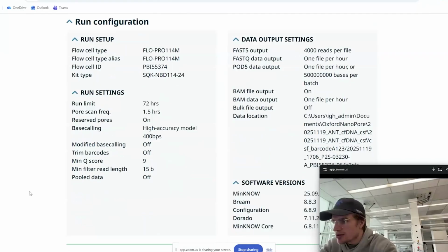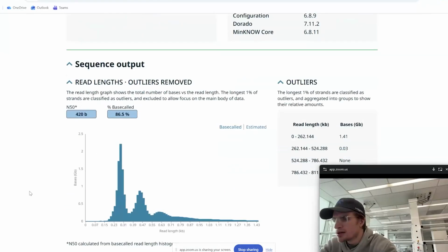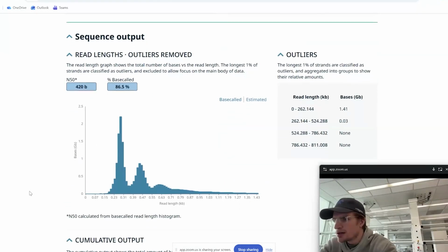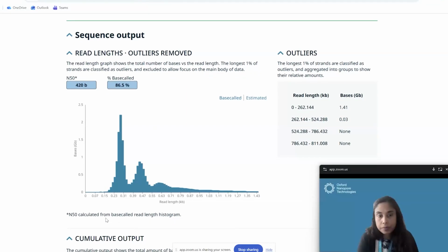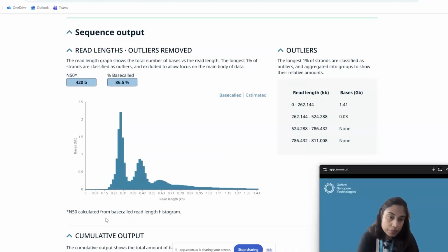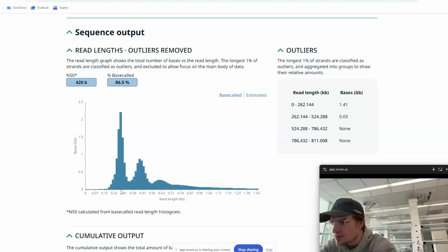And then running through, again, this is now our updated histogram. Yeah. Continues to look representative. Yeah, it's very similar to what we were observing yesterday. Does not look like anything got shifted that much, right? I think so. Yeah.